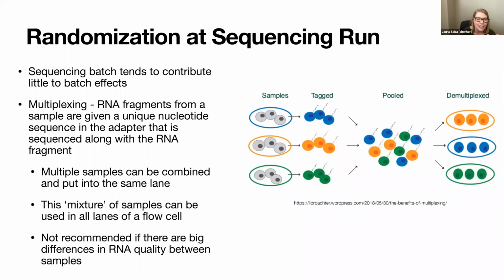So this technology has really helped a lot in getting rid of any batch effects that may be due to lane or sequencing run, but we typically don't see a lot of variation in the sequencing part. If we prep the same library and ran it on multiple days, or on 2 different lanes, we don't see many differences or batch effects there.